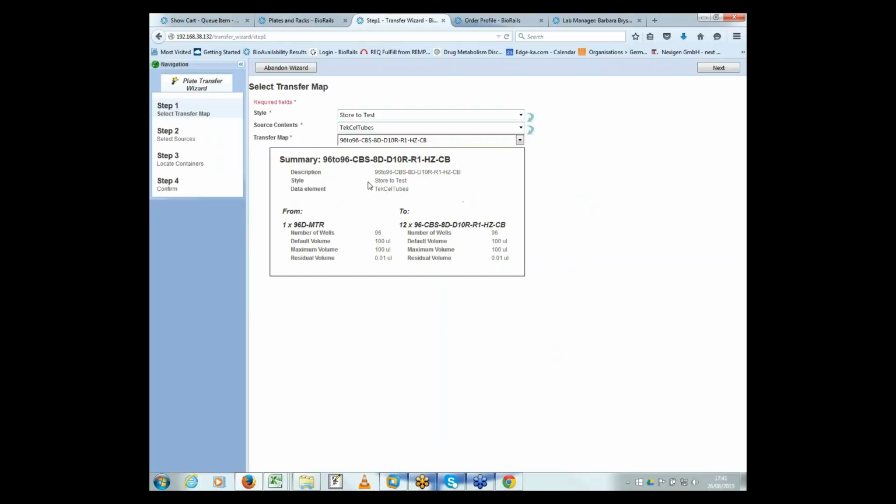What the transfer map is, it takes a 96 position matrix tube rack and it stamps it out into a 96 well dose response plate. So it includes taking multiple liquid transfer operations from the source tubes and then out into the resulting dose response series across the plate. And I created this as something called a custom plate map. There is wizard support for defining plate transfer maps for dilution series, stamps, quad mappings, all sorts of different transfer operations are available.